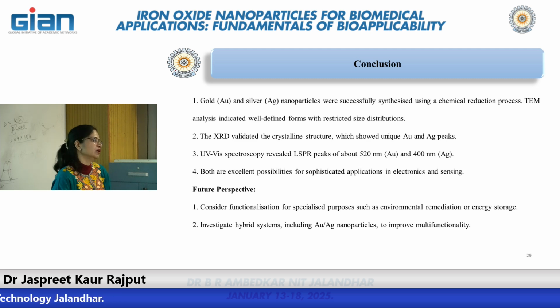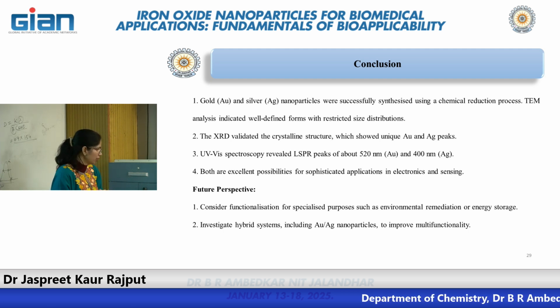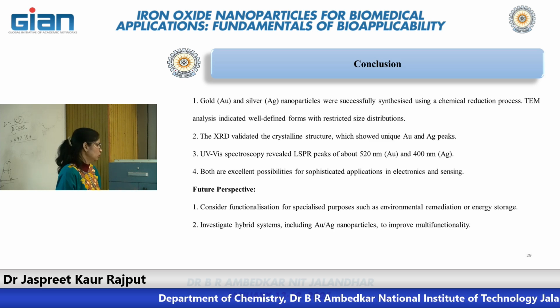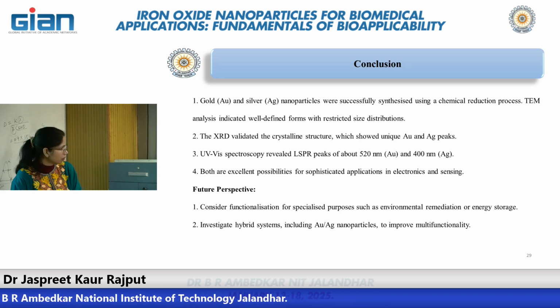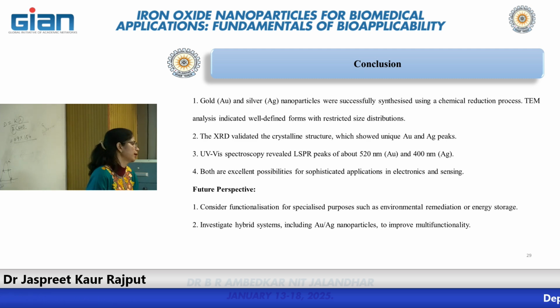You can find other information related to these nanomaterials also. So you can run the UV today, and you will see where the absorption is in your synthesized nanomaterials. Again, Tauc plots you can draw by yourself, and from that UV data you can draw the Tauc plot and find out the band gap of your material, right?